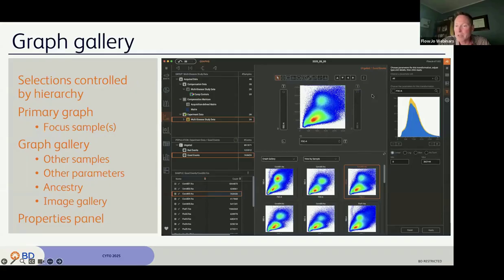So if you hit the T button, you get this to pop up. You could also hit the T button directly from the right. So on the right, there are controls for what parameter set do I want to filter one of my axes to, what kind of plot do I want to look at, what kind of transform do I want. So all that stuff is just always present on the right. You can expand it or collapse it using the little 3-line button over there. Up to you. So you can allocate as much room as you want to plots and as less room as you want to controls, or more, depending on what you were doing at any given moment.